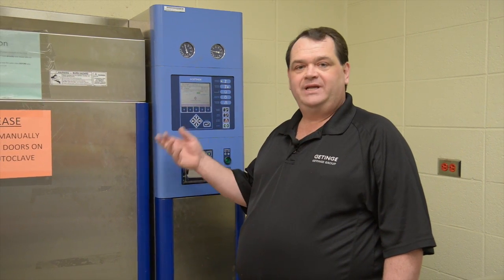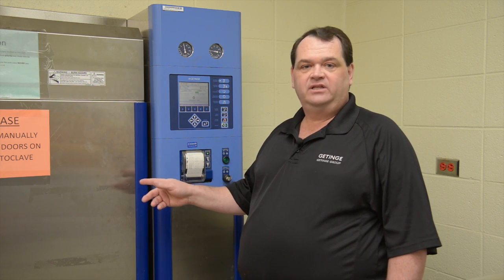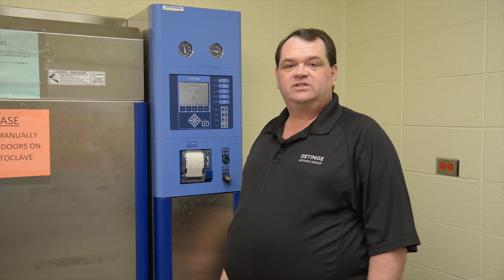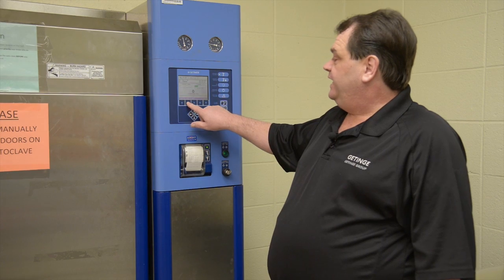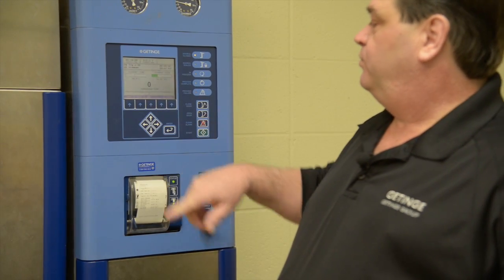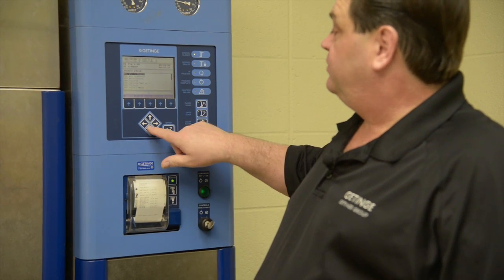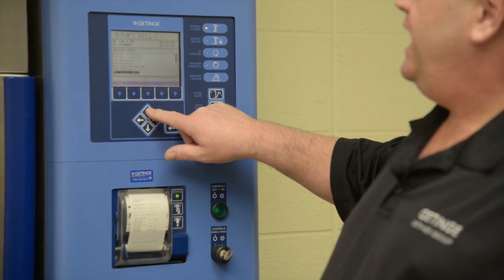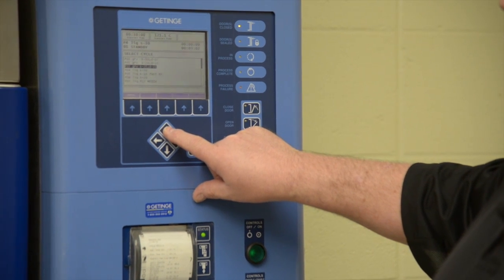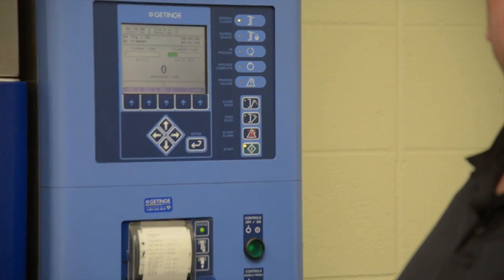With a basic understanding of the different components of the machine, we're now going to go through the loading process — this is where you put the load into the machine. We will be selecting a cycle, opening the door, and properly loading the machine. First we begin with selecting the cycle. In the indicator keys we locate 'select cycle' and push the button. The display changes to bring up your pre-programmed cycles. We scroll down, locate the cycle we're looking for, push enter, and this brings up the desired cycle.